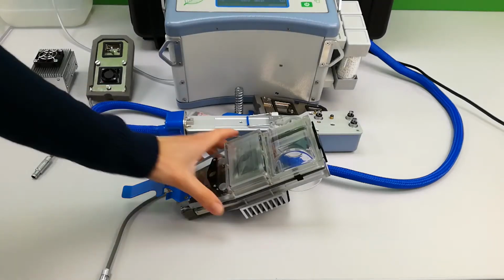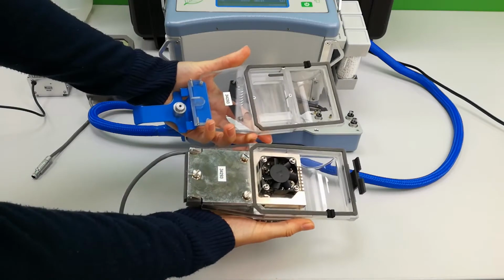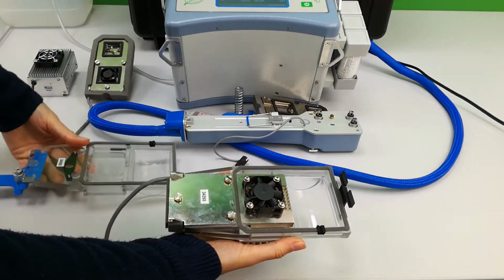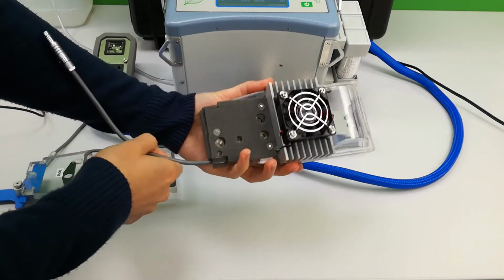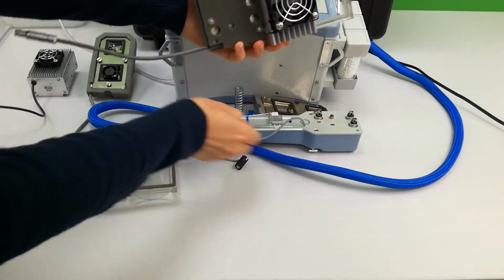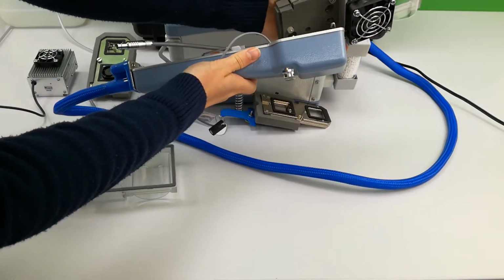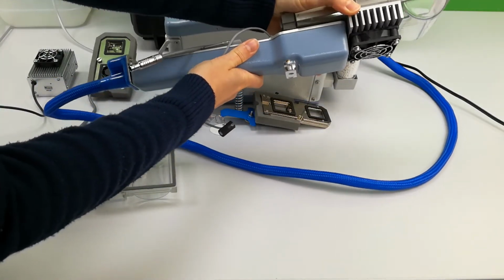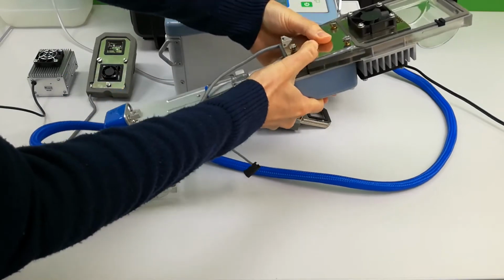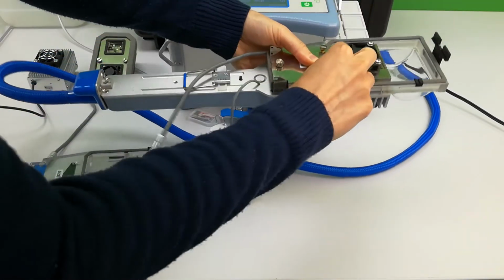This is the Conifer chamber with a clip at the front to secure the upper and lower jaw together when the chamber is filled. This ensures a good seal around the conifer needles or branch. The 3 screws are in the same place as with the other chambers to attach to the handle. Push down and begin to tighten the 3 screws by hand.